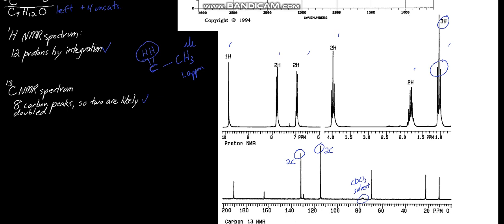You would expect that to be a quartet, but we don't see any quartets in the spectrum. We do see what looks like a sextet, 6 lines, if you looked carefully. That would require another CH2 here, and really everything here is CH2s, except for this 1 hydrogen we'll look at in a minute. So this would result in 6 lines, 1, 2, 3, 4, 5, 6, due to the number of neighboring hydrogens splitting this signal. Now, look at the chemical shift here, 4.0 ppm, and the only thing that really can de-shield protons, and probably this carbon as well, to that extent is an oxygen atom. So if you look at your tables, that can be seen. And so look at all these pieces we have connected together by interpretation of the splitting.